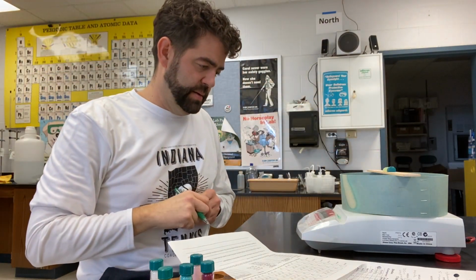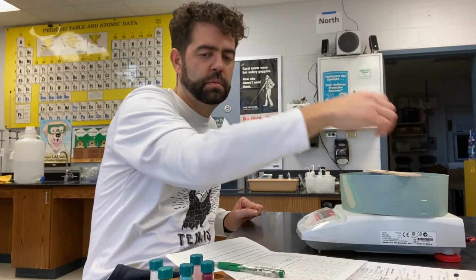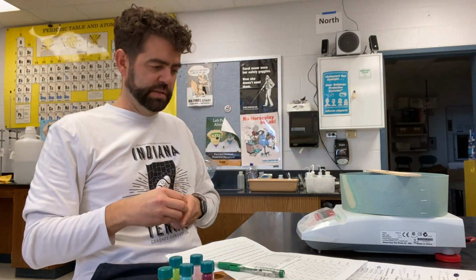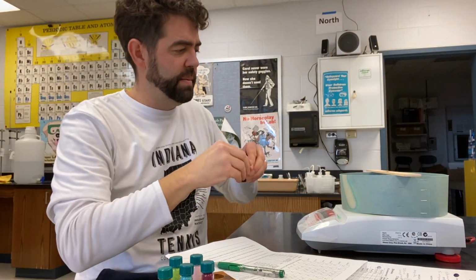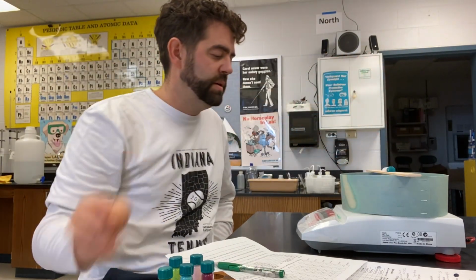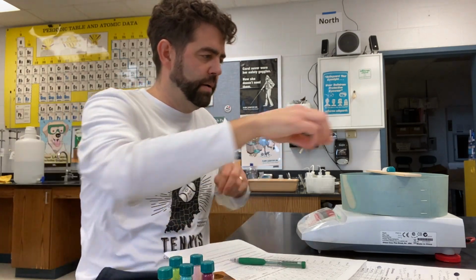See what we get. That's a tiny one, 0.12. And last but not least, and again, I'm checking to make sure that's a 0.00. It's been zeroed out. The zinc is ZnCl2. I'd say that's white. Pretty simple color there. And I'm getting nothing, so that would be 0.00. Cool. So that's pretty neat.